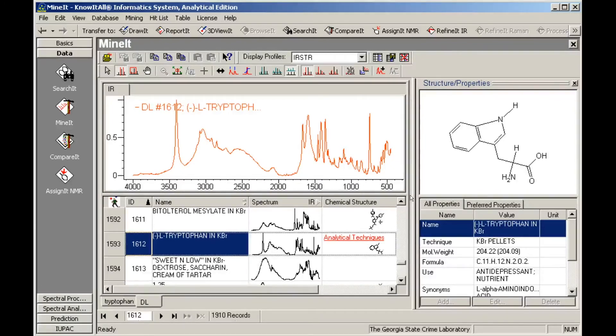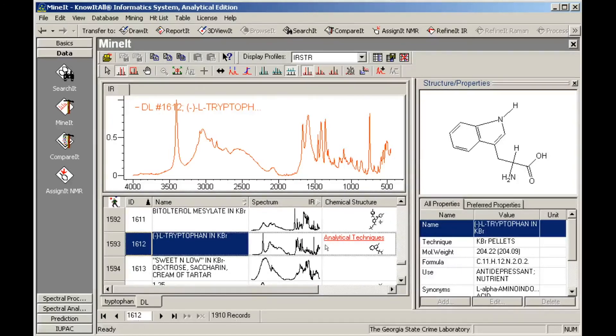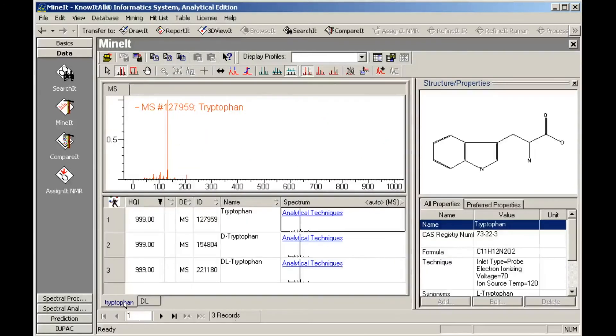We can switch back to the hit list by clicking its tab under the database pane, then use the back arrow to return to the Search It application, where we will modify the search parameters.